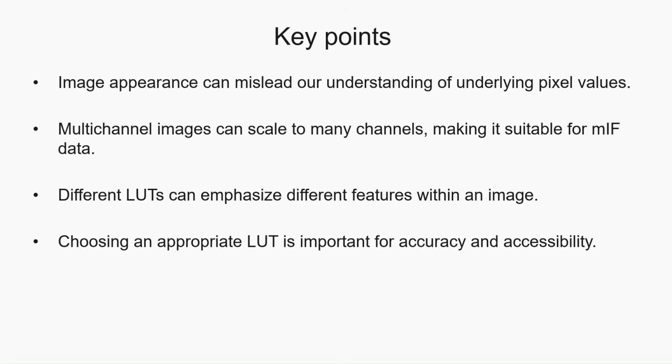To conclude, here are the key take-home messages from this module. First, image appearance can often be changed dramatically without altering the underlying pixel values. Second, multi-channel images preserve original microscope data and are generally preferred for quantitative analysis. Third, different LUTs can emphasize different features within an image while displaying the same underlying data.